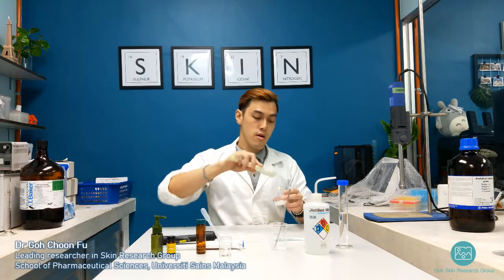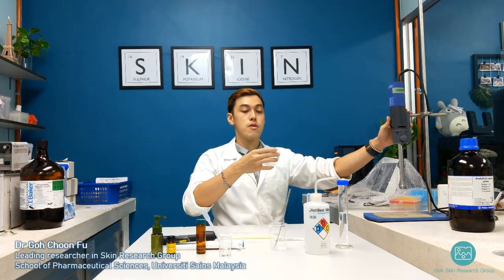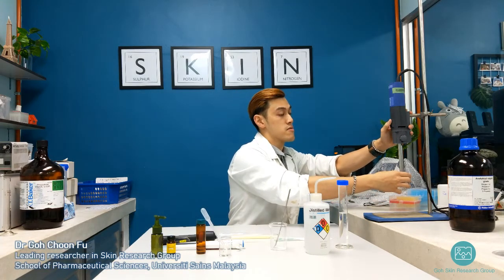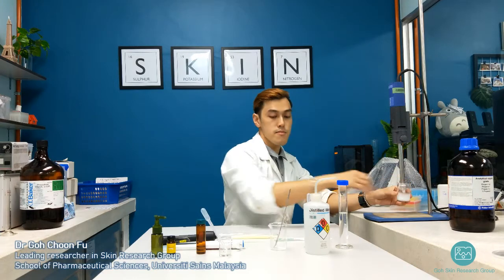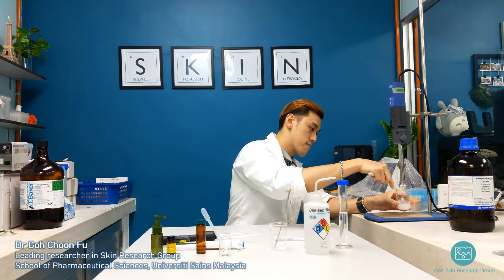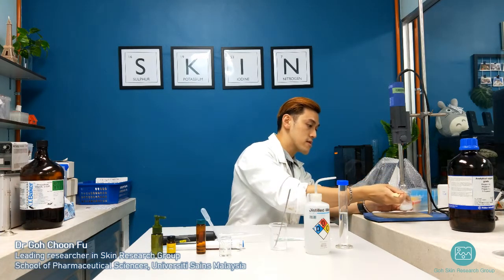Now, as we want to shorten the mixing time, if you have access to a homogenizer like this, you can use it to help break down the gel and make it into a nice homogeneous gel. Check in between to see if you are able to get the gel form. You may see a lot of bubbles, that's okay. That means the gelling is happening.